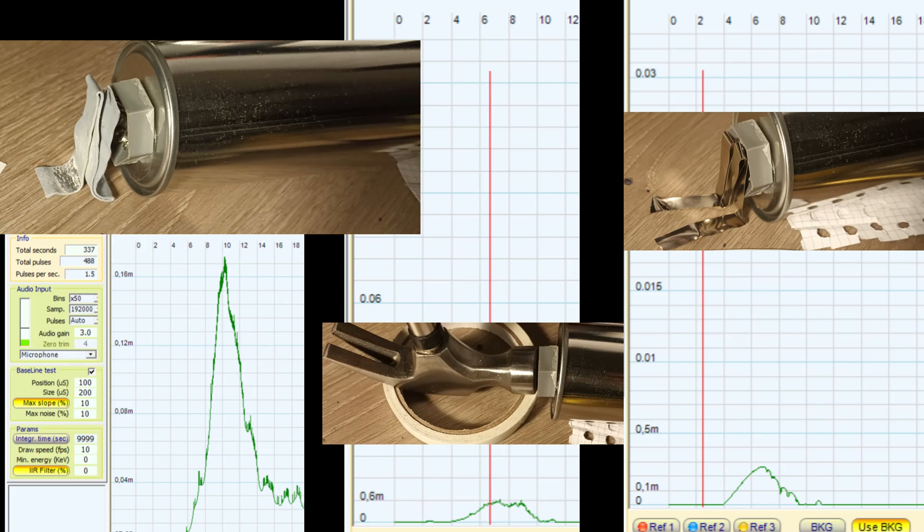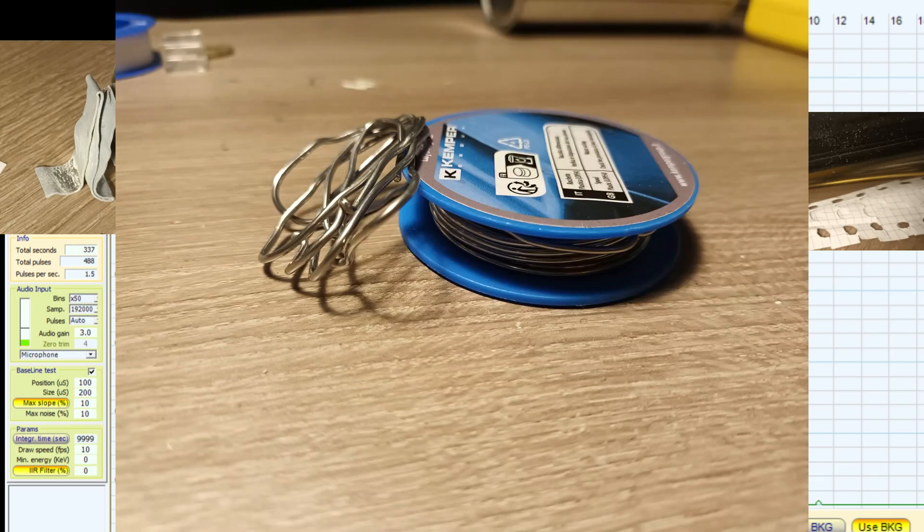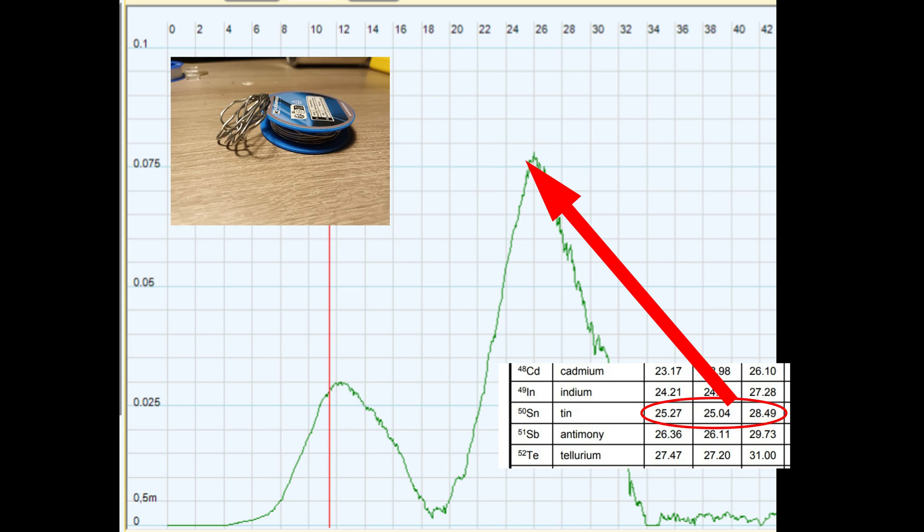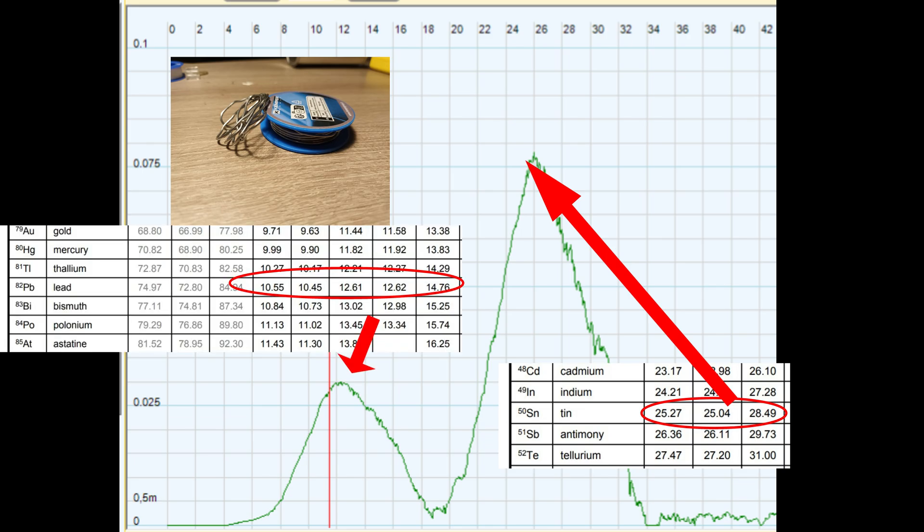But the more interesting one is the following. So I've been using this soldering compound for a bit now and I always thought that it is simply a mixture of tin probably on the order of 90% and some other stuff like lead and flux. But after taking an XRF spectrum of it you can clearly see that there are two intense peaks and one is the one from tin which is at 25-28 kilo electron volt and the other one at 12, we have already seen just before, it's coming from lead. In particular they come from the L alpha and L beta transition of lead which normally we couldn't see in other metals because they are too low in energy, but being lead of such a high atomic number they are visible. So this time this machine has been useful for a real application because otherwise I don't know how much time I would have needed to notice that I was using lead soldering.